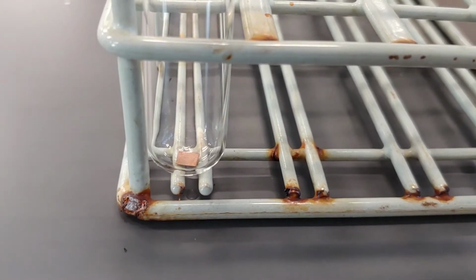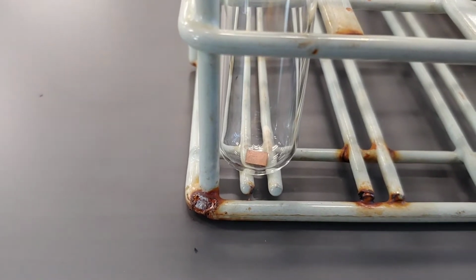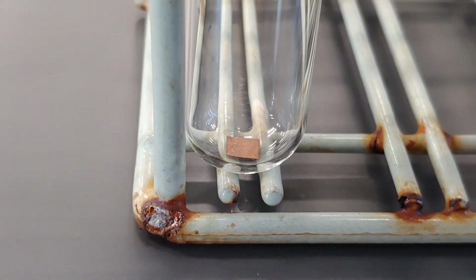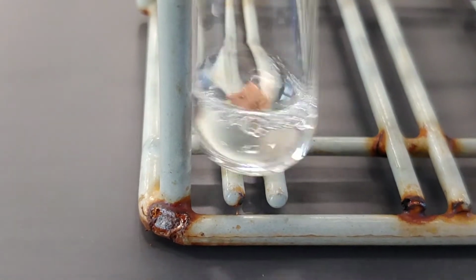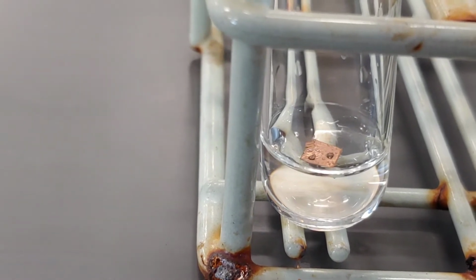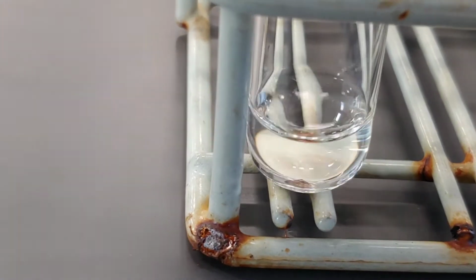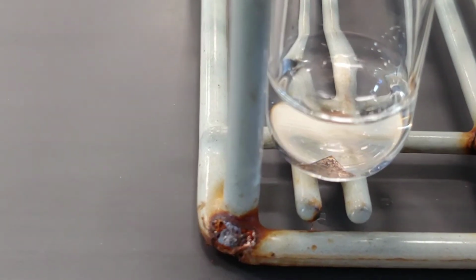All right, reaction number 4, solid copper metal. You can see it sitting there in the bottom of the test tube, and to that we are going to add aqueous silver nitrate. That one we're going to let sit, and we're going to come back to it. Let me give it a stir. We'll let it sit for a little while, and we'll come back to it later.